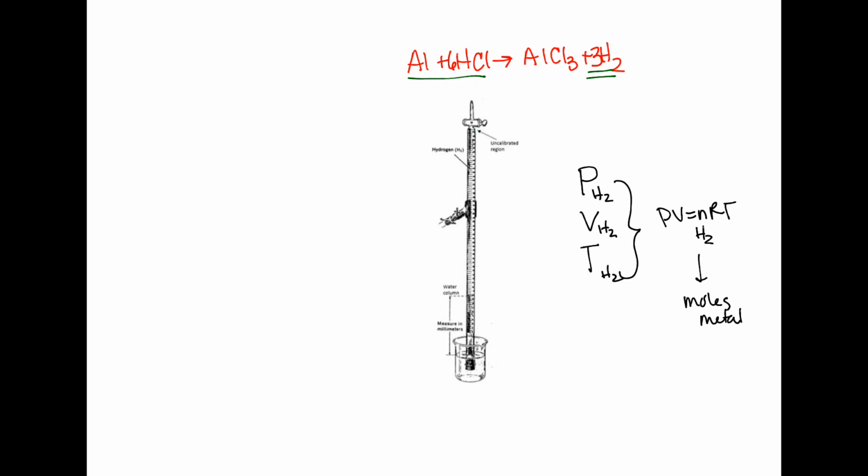All right, now let's talk about finding the volume of our hydrogen gas. The nice thing is we're doing this in a burette, and burettes have those nice tick marks on there so we can measure volumes. The issue is that burettes aren't read upside down like this. And if you haven't used a burette in a little while, I'm just going to redraw this over here, and kind of draw the bottom of it.